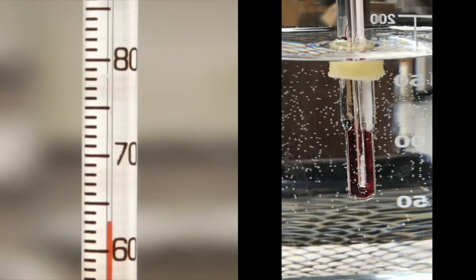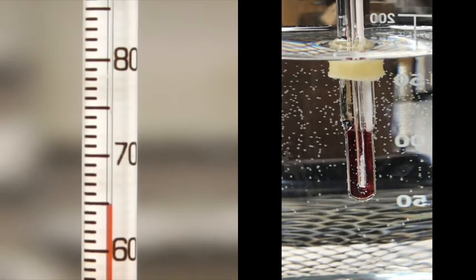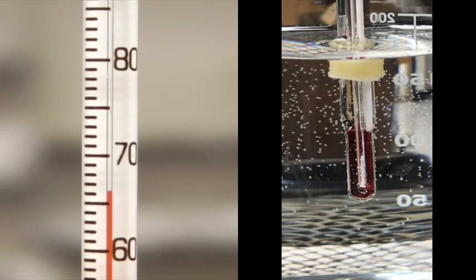So we're moving up to about 63, 64. So I'm going to slow that down a little bit. I'm going to just remove the heat a little bit and see if there's enough heat still in the beaker to take that water up a little bit. You seeing any melting yet?